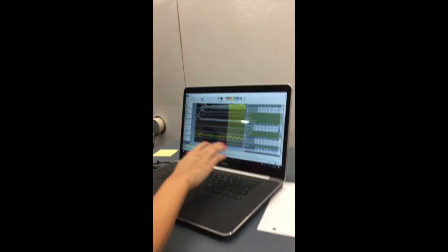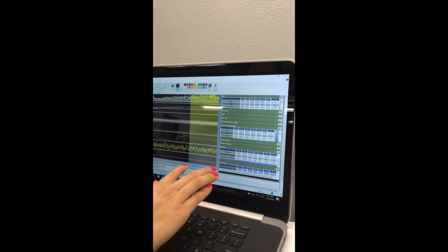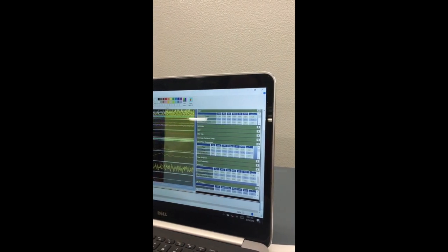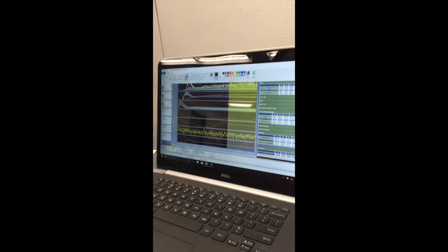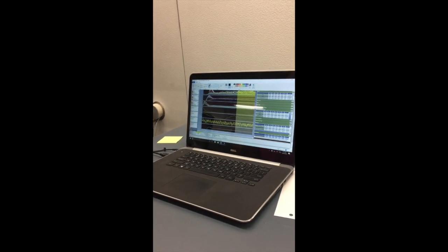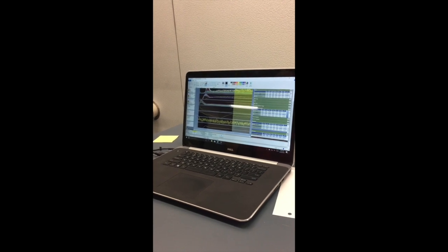As said before, the yellow part of the screen is the Show Stats region. This is the yellow part highlighted. The values on the right, including the percent change for RCT, ambient, and heat flux, are shown just for the 30 minutes of the Show Stats region. When this is completed and there's not a lot of variation in your results, you may hit the End Test button and save your report. After you write down the stats numbers, make sure you take a screenshot of your results, save it under Paint under the same file as your results.